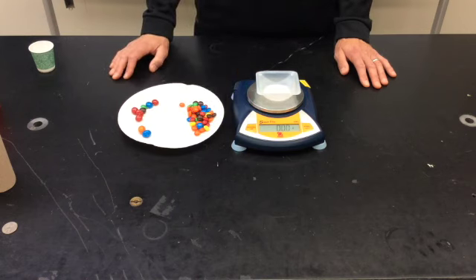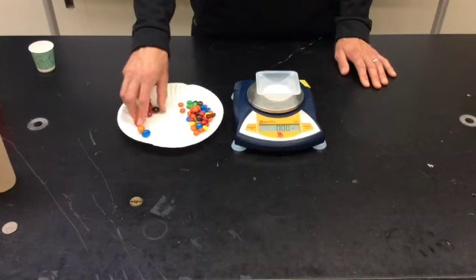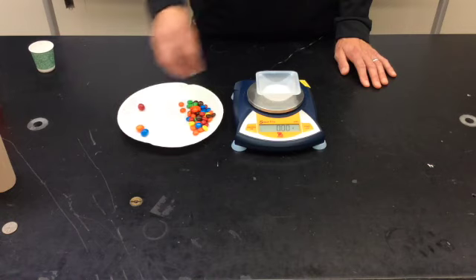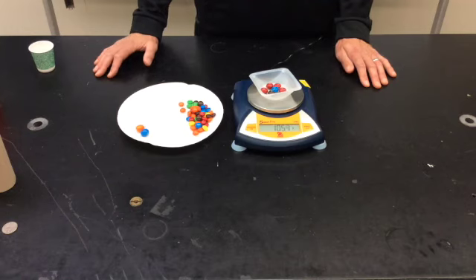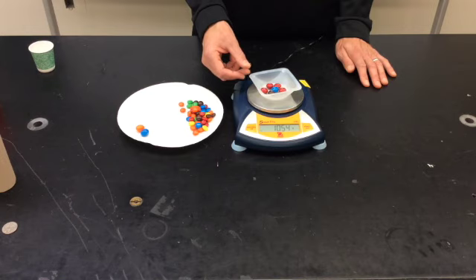We're going to repeat this process now for our peanut butter M&M isotope. The total mass of our peanut butter M&M isotope is 10.54 grams.